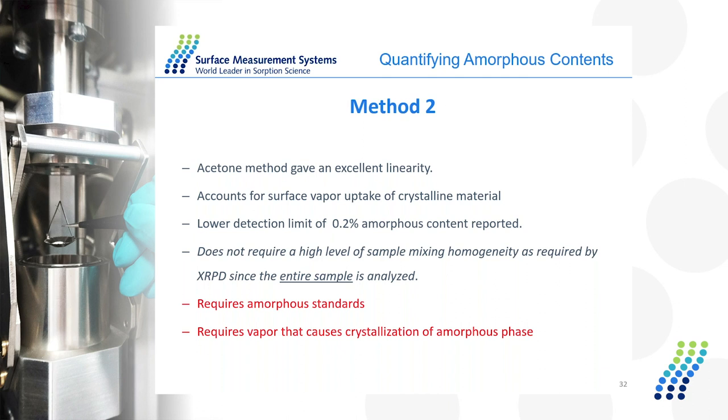We have four different methods for the determination of amorphous content, and this is just one of them. If you're interested in this topic, we could send you the other methods along with the application notes through email after the meeting.